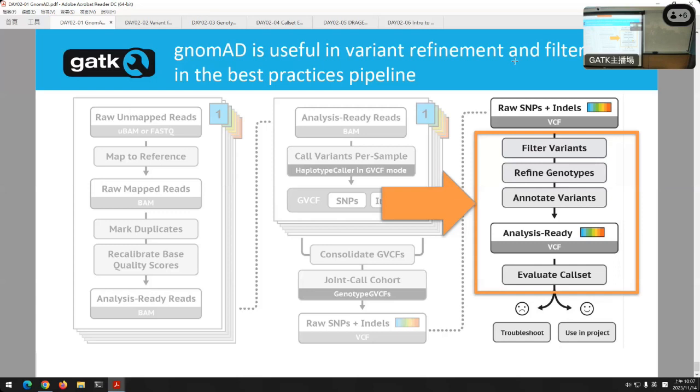Alternatively, if you are a clinician who is looking into that variant as a potential cause of disease, you might go to gnomAD, and you don't want to see that that variant is completely missing, because then you would conclude that's a really rare variant. Instead, you might see that it's present, but it didn't pass filters, and then you might draw a different conclusion. Maybe it's an artifact, or maybe it's a variant that does occur in the population, but just wasn't super high quality in gnomAD.